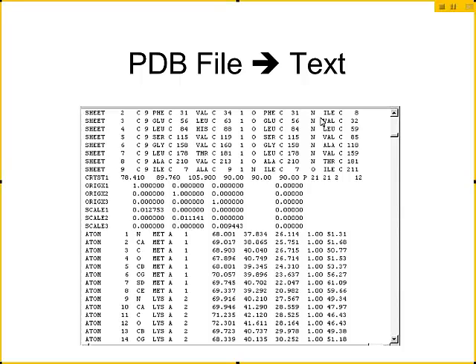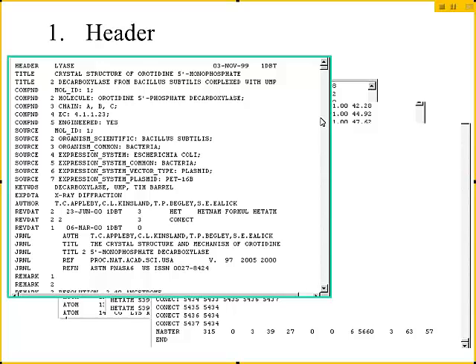You can use an editor if you're on a Linux machine or many of the main editors. Now, if you look at it in Word, you don't want to save it as a rich text format. You don't want to save it as a dot format. You need to save it as a text format, TXT. It's a TXT file, just a simple ASCII text file. So you can look at it and save it there.